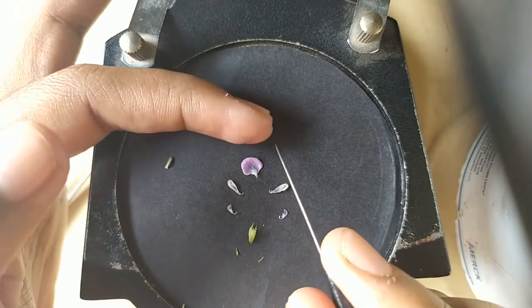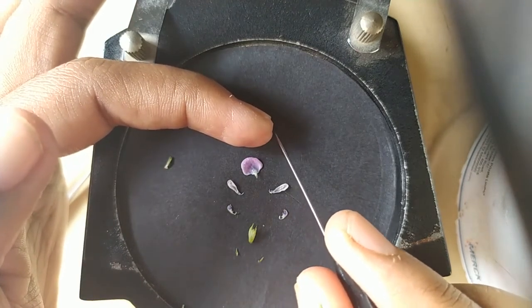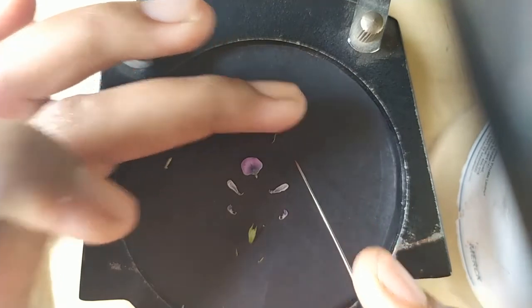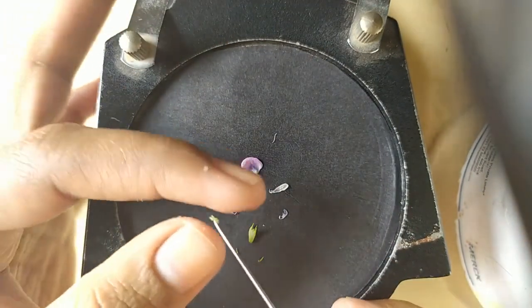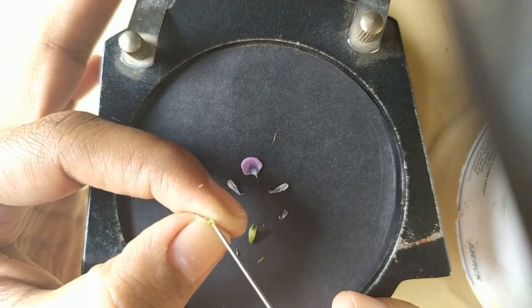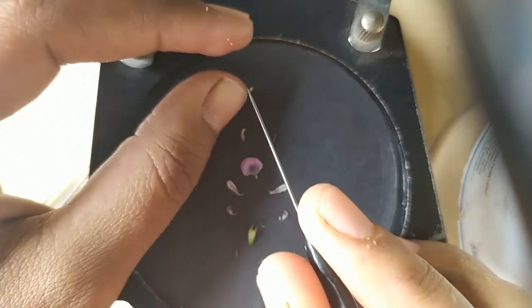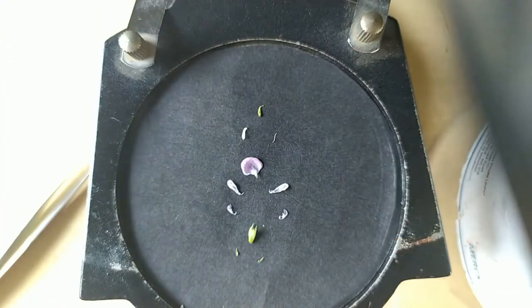As in mung and urad, the dissection is the same in the case of soybean, but the parts are too delicate and too small, so it is somewhat hard to handle the flower. Then remove the gynoecium. This one is the 9 anthers bunch, and then remove the gynoecium.